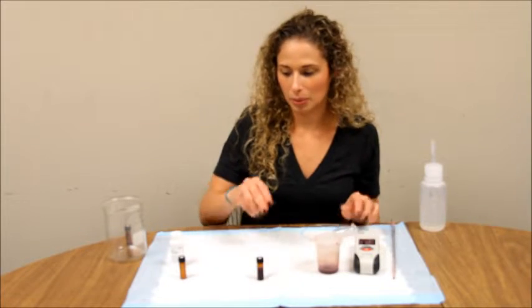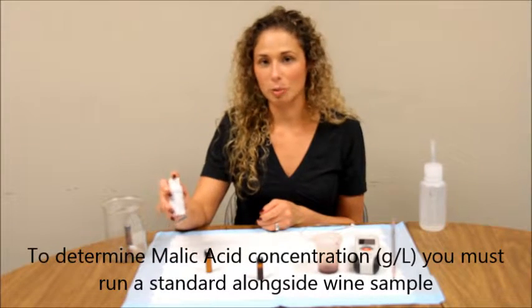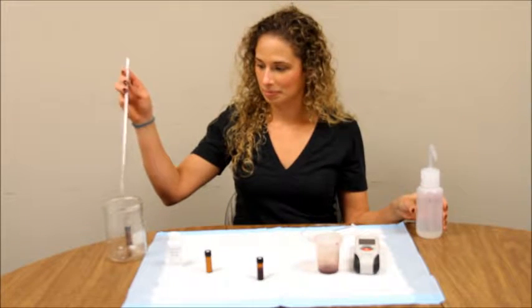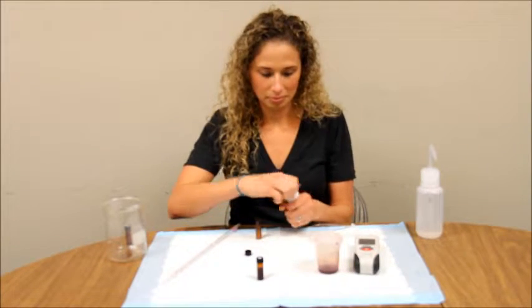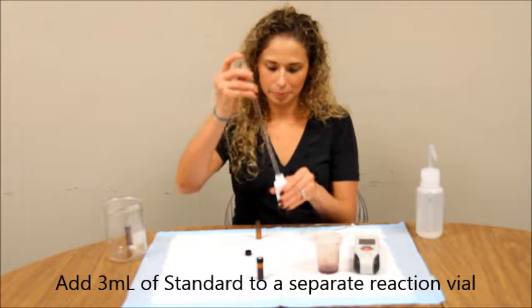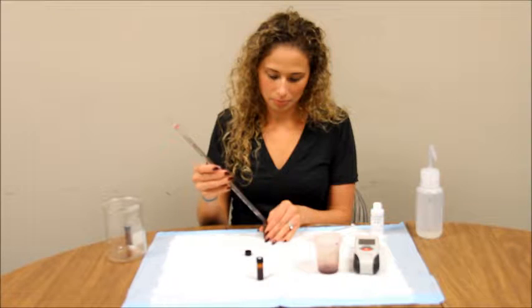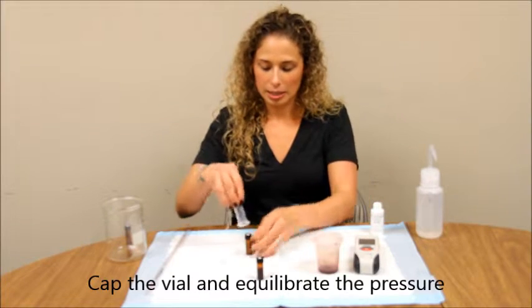If you would like to determine the quantity of malic acid in your wine, you will need to run a standard alongside your vial. Today I am using the 0.1g per liter standard. Add 3ml of the standard to a separate vial. Cap your vial and depressurize like before.